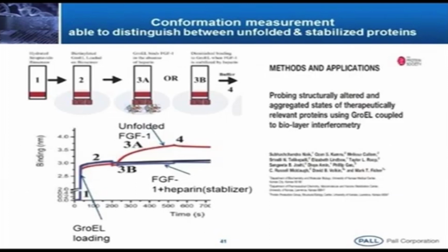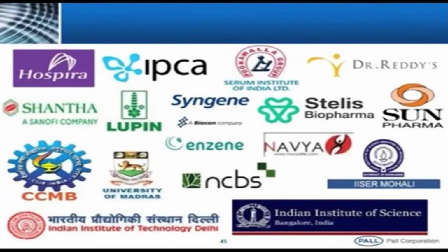Here I am showing conformational measurement, folding, unfolding and so on. Right now this kind of application is being worked on at IIT Delhi by Professor Tapan Chaudhary. So in India we have installations everywhere, in industry as well as academia.